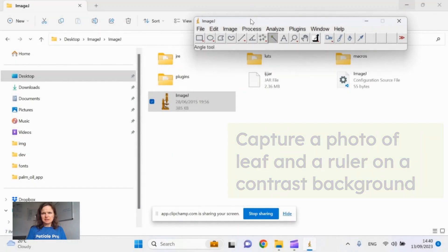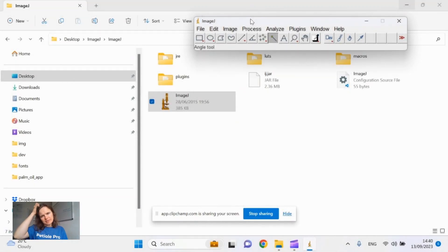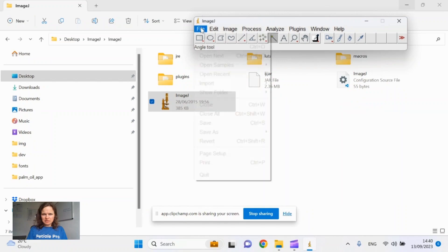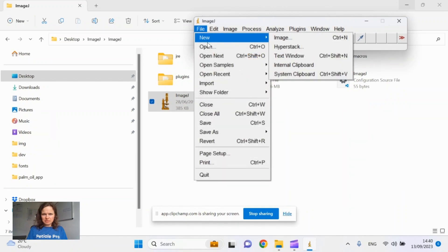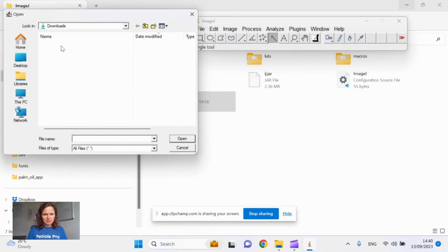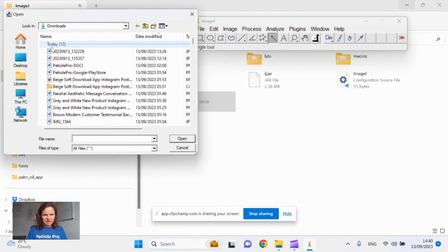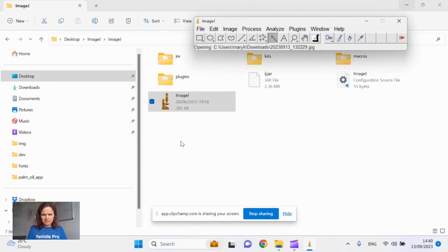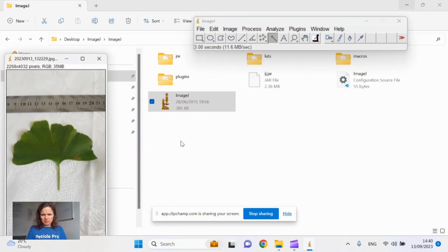Here is our ImageJ. What we need to do is open our photo of the leaf, which we made a moment ago — the leaf and the ruler. It is very important to have a ruler as well.